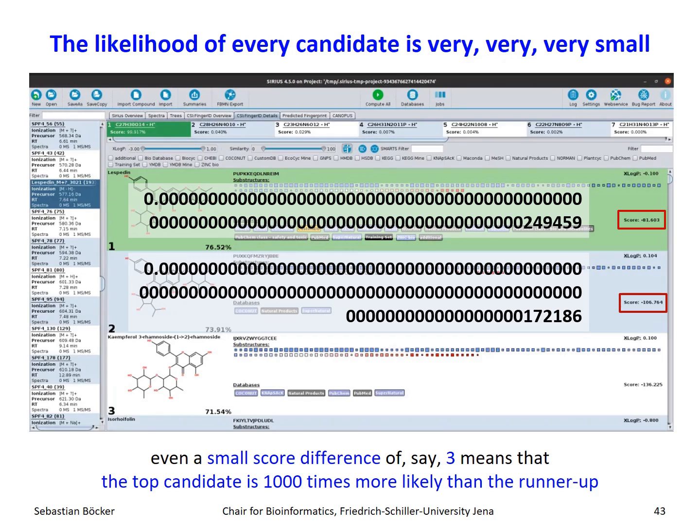I would like to mention one more thing, and that is also in this nice graphical representation, we tell you something about all the molecular substructures in there, all the molecular properties. Those are the dots. The blue ones are molecular properties which are present in this candidate and which we also predicted to be present from the tandem mass spectrum. The bigger the dot is, the better the molecular property predictor performed in cross-validation. And the bluer the dot is, the higher the posterior probability. Yeah? And the same is true for the red ones, just the other way around. Hopefully you find, for the correct interpretation, few red dots, and they are very small. That would be perfect, and not very red. That's the best that can happen.